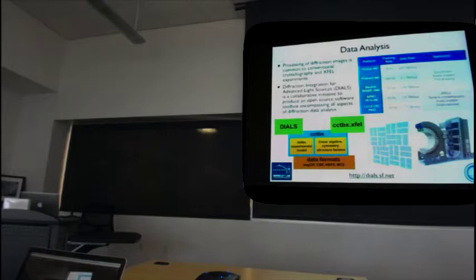Now, of course, we can do diffraction experiments. We can collect data. What do we do with that data? This is the theme of the workshop, so I'm not going to say much about this. You're going to learn an awful lot from several different people. But one thing I wanted to point out was that there's a bit of a convergence, again, between conventional crystallography and FEL crystallography.